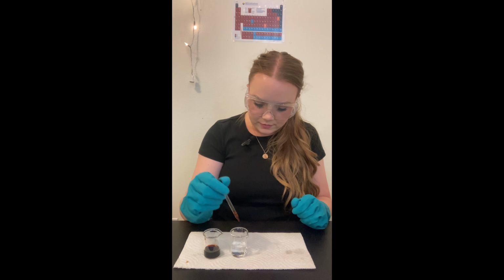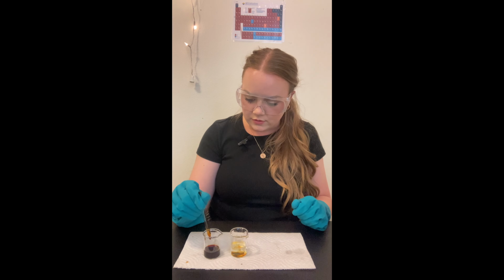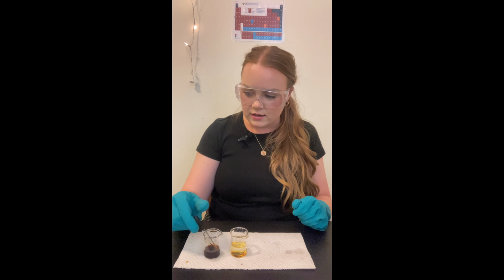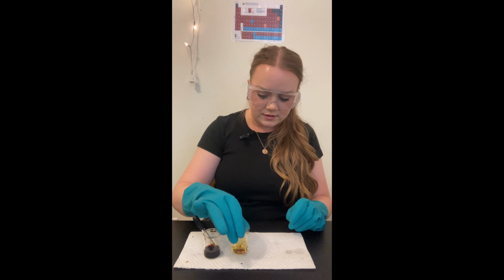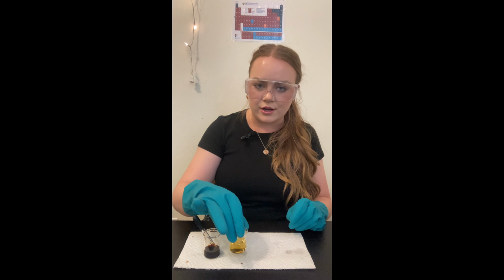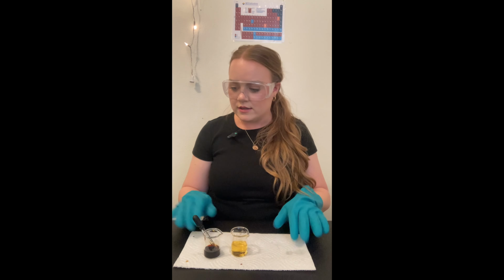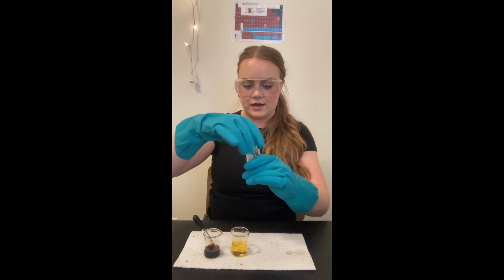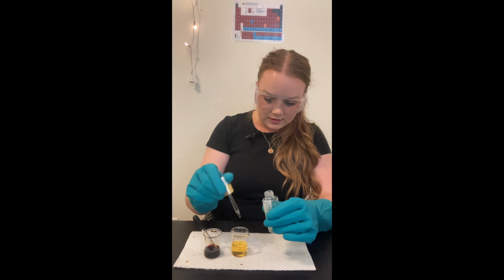Let's do 3. And I want something to stir it, but I think I'm just going to have to, this is not what you should do. You should be using Erlenmeyers to mix, but it is okay. So I'm going to add this until it turns clear.